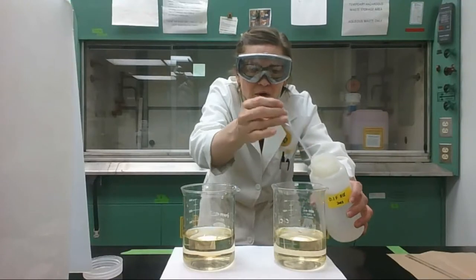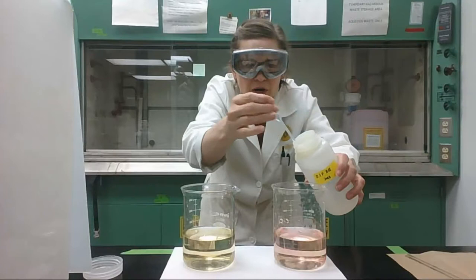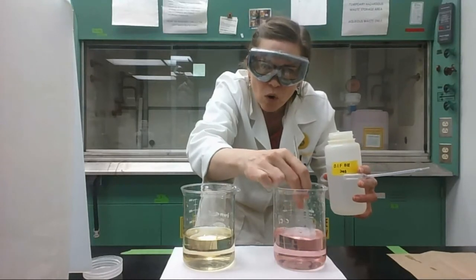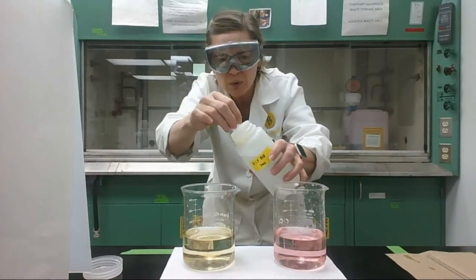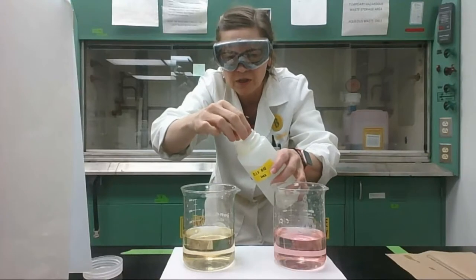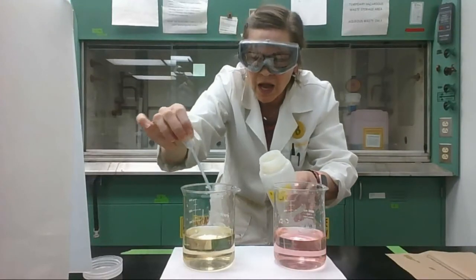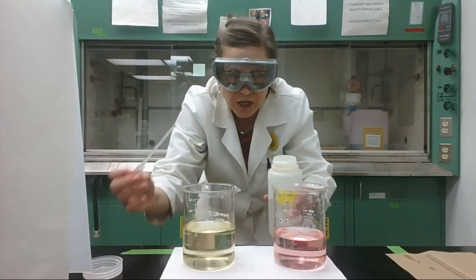So here we go. 1 squirt to the water. Ooh, I see some pink there already. 1 squirt to the buffer. I think that water may have turned already. Yeah, that water may have turned. Let's keep adding acid to the buffer and see what happens. Another squirt, no color change. And another, no color change. The buffer doesn't seem to be changing pH. I bet I could pour the acid into the buffer and it still won't change color.